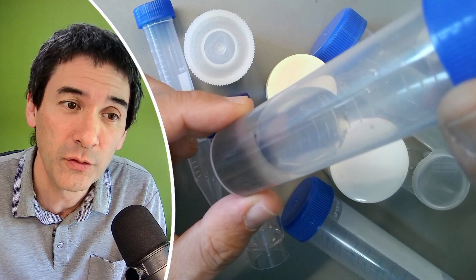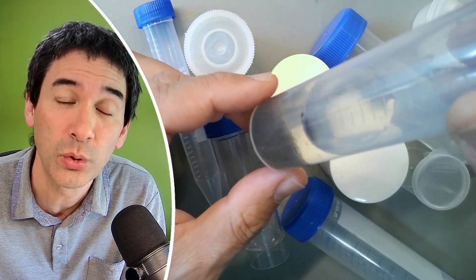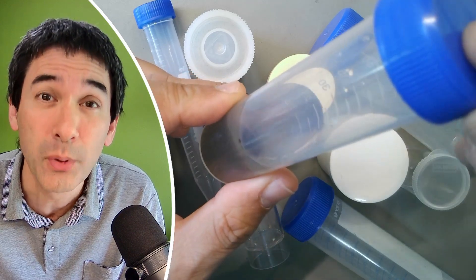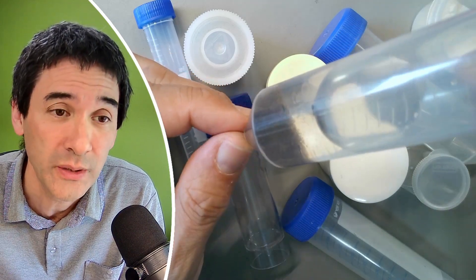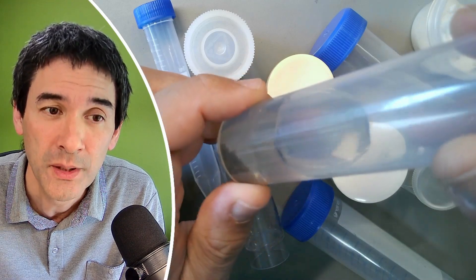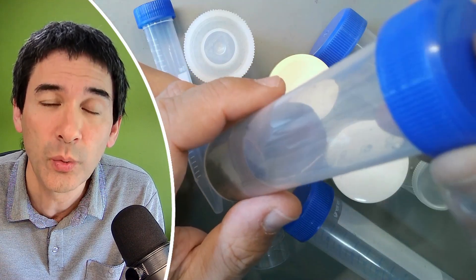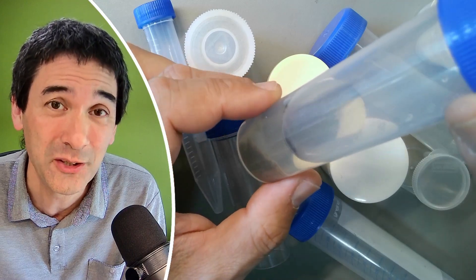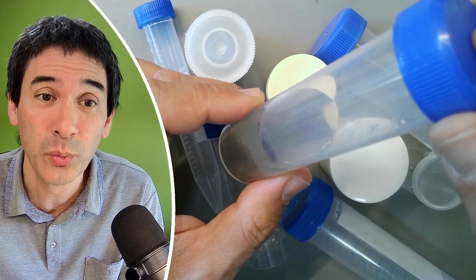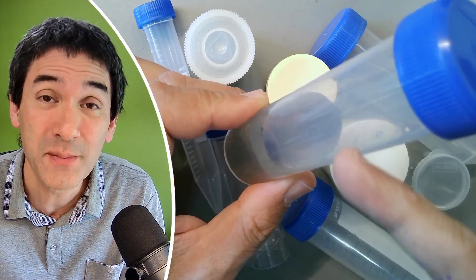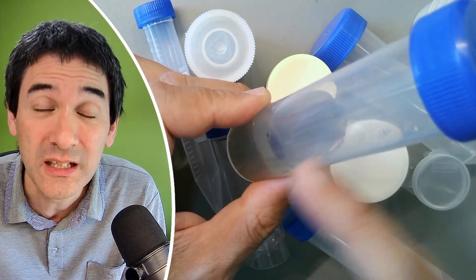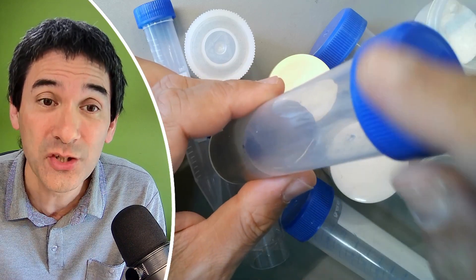You can already see over here that there is a container here, it's a centrifuging tube made of plastic, it's a disposable one and you see that I already collected a little bit of water in here and there's some insect larvae floating around. This tube is actually one of my favorite ones, it's one of the reasons why I'm showing it to you. It's quite cheap and it's transparent so light is able to enter it because sometimes algae need it for photosynthesis and it's also watertight.